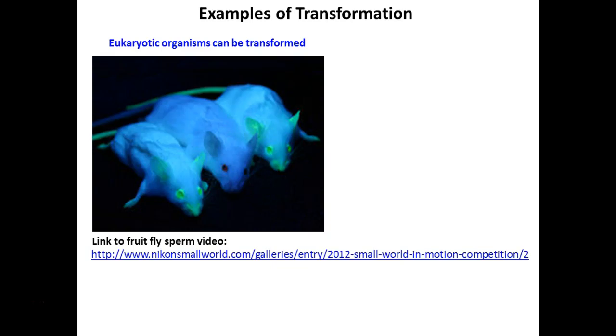So you can see it. The great thing about fluorescent proteins is you can see them. You can distinguish them from other proteins because they fluoresce. So a lot of times it's used as a marker, in other words, to allow us to visualize a genetic change, because this is genetic change, y'all, that we're going to cause to happen today. We're going to actually put DNA into the bacteria that allows them to make this protein. And that's a very important point. Transformation is actually adding DNA that the organism can utilize to then do something different.